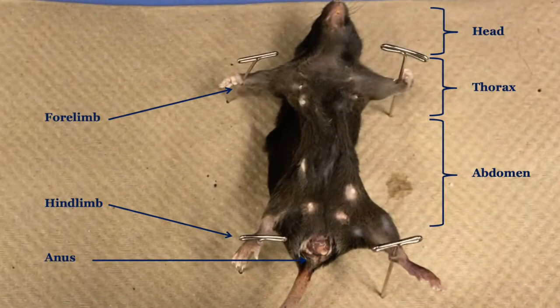Examine the following regions of the mouse: the head, trunk consisting of the thorax and abdomen, forelimbs, hindlimbs, and anus.